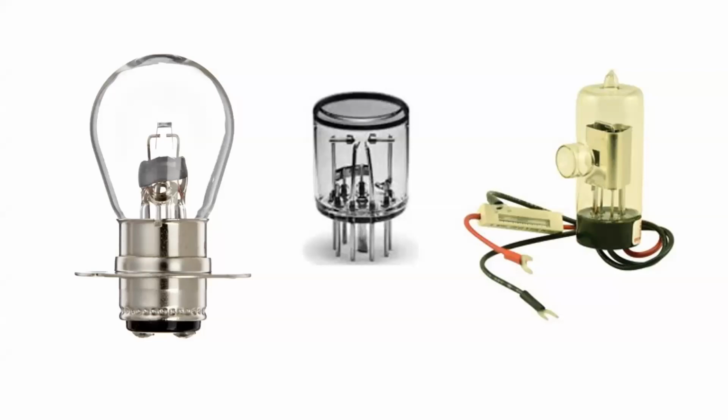Okay. So we mentioned 4 types of lamps, right? Sources for UV-Vis. These are 3 of the ones that are sort of interesting to look at. So in this first one, if you had to take a guess, which one is this? Tungsten. Tungsten for sure.